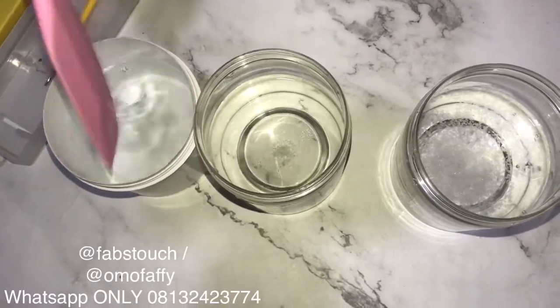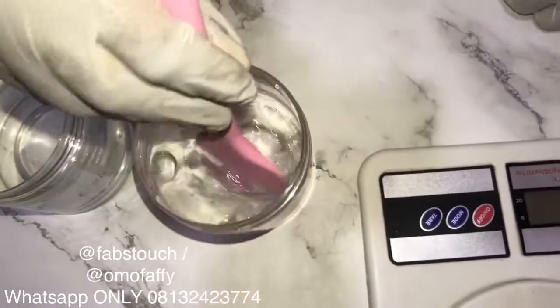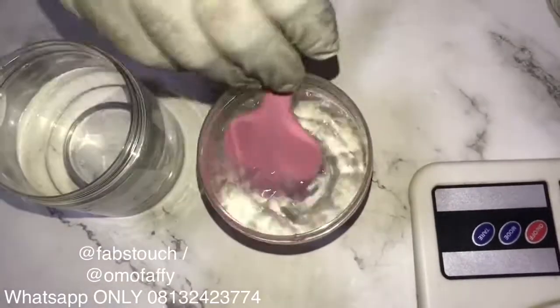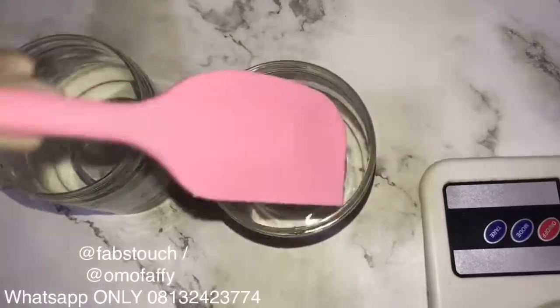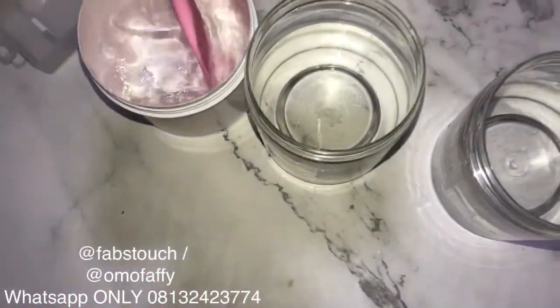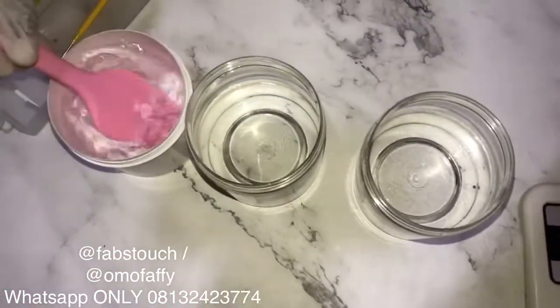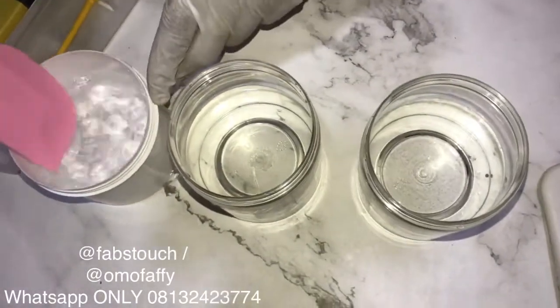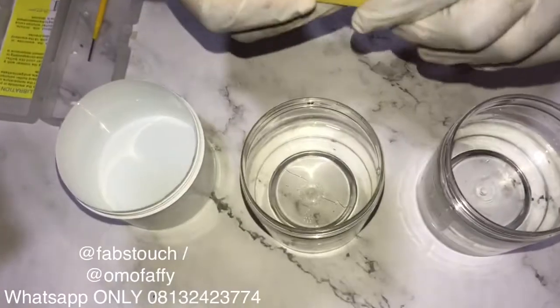If your calibration is wrong, there's every tendency that your formulation using that particular pH meter will be wrong too. Your buffer powder usually comes with your pH meter — whenever you purchase a new pH meter you get at least two buffer powders with it. If you don't get any with yours, you can always purchase them separately, because you need them to calibrate your digital pH meter.